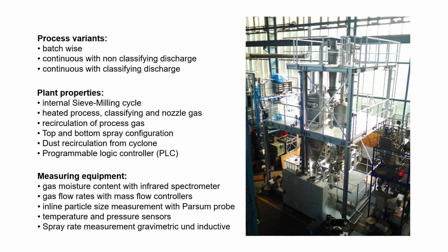And last but not least, we control the spraying rate by a balance, gravimetrically, and we also have an inductive liquid flow measuring sensor.